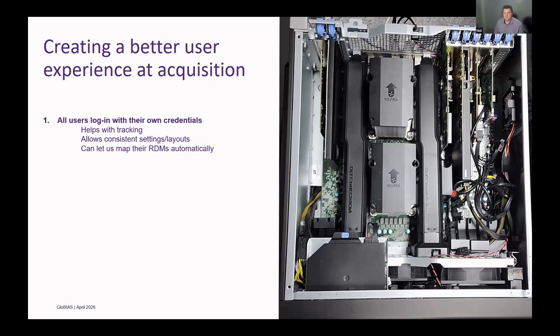Are the cell biologists using this system? Are the developmental people using it? Are people shifting with trends? It also means that we have consistent settings and layouts. So when one user logs in and changes something for their needs, it doesn't affect the next user, and then that user isn't coming and finding me and saying, something's changed. So that frees up my time.